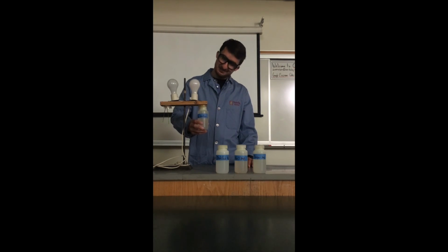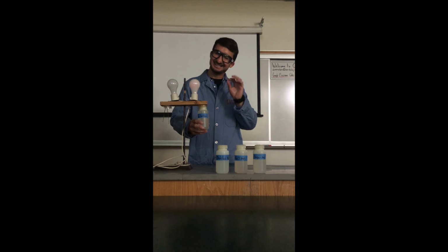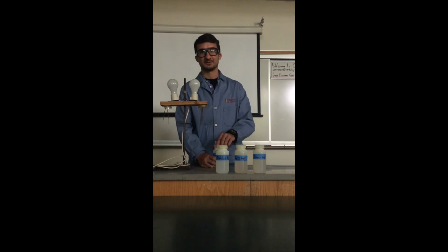I don't know if the camera's picking it up, but you can see a little bit of a glow in the light bulb. Not much. If I stop there, it's gone. Put it in here. Get a little bit of current to flow there. Yep, just lights up a little bit. A little bit of electricity will flow through there, but doesn't conduct nearly as well as the salt water did.